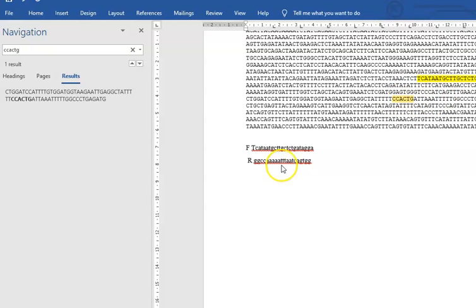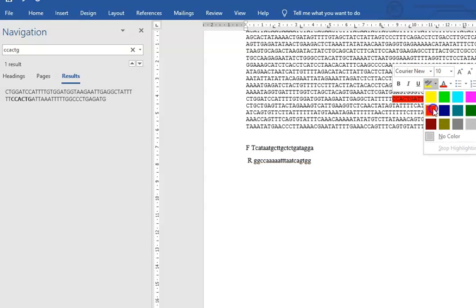I'm reading the sequence backwards and anti-sensing it in my head, and there's a run of 5 A's there, so there should be a run of 5 T's, which you can see there. Then it should go GGCC, which I can see ends at that point there. So what I can now hopefully try to do is highlight that region. If I can get my little highlight tool to behave. There we go. So I've managed to highlight that region, and that is my reverse primer. So I'm now going to make that a different colour, red.